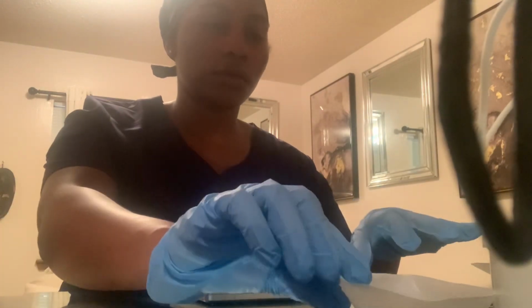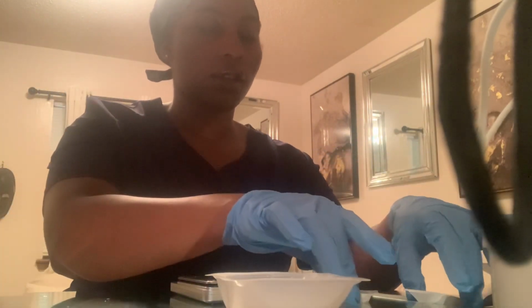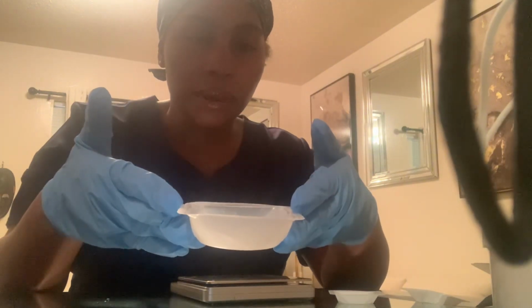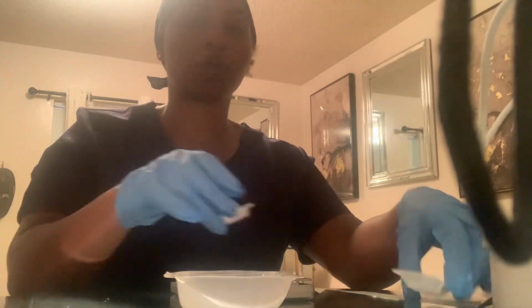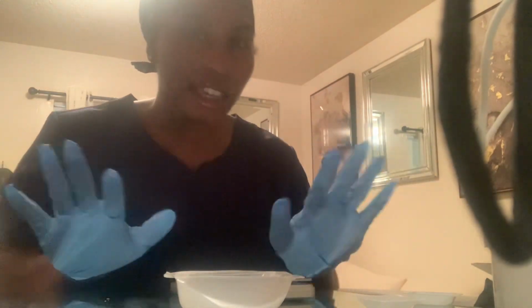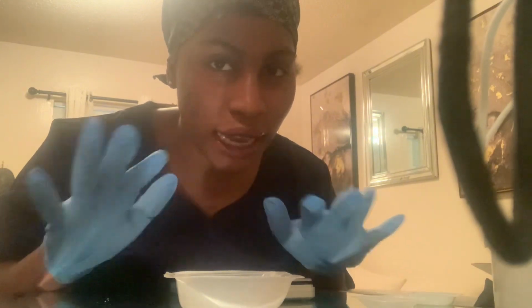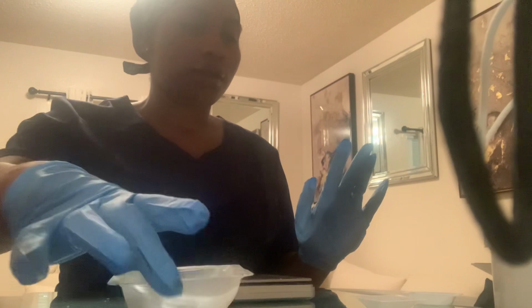And if you noticed, I was using this one for the bigger weights, the bigger grams. And then this is for the smaller grams. So just to get that out there, I don't think it really matters here, but this is for educational purposes only. But in reality, when you are actually doing this, it matters a lot. It's so important. But I'm just going to continue using this because I am working on 14 grams now. So let's clean all this stuff down first.